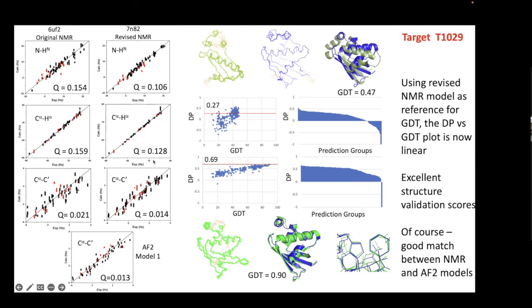And kind of as an independent validation, we looked at the RDC plot. So these are the Q scores that we're talking about. The original structure had acceptable Q scores. They were pretty happy with their Q scores for NH, and it's 3 different RDCs. The refined structure actually has somewhat better Q scores, and it actually calls into question using the RDC Q score for structure validation, because even some incorrect structures can have okay Q scores. And so this is really a kind of important example.